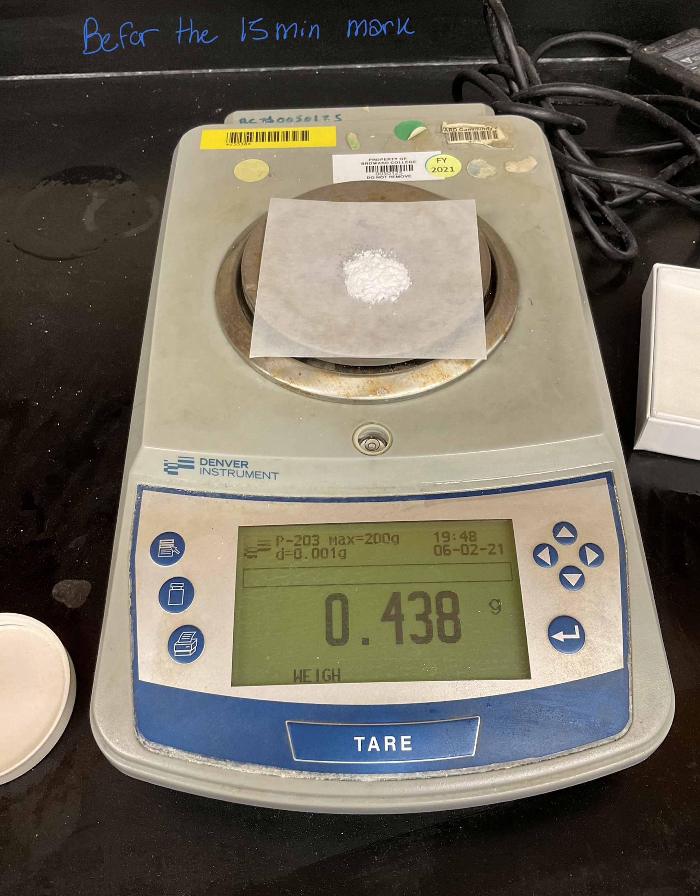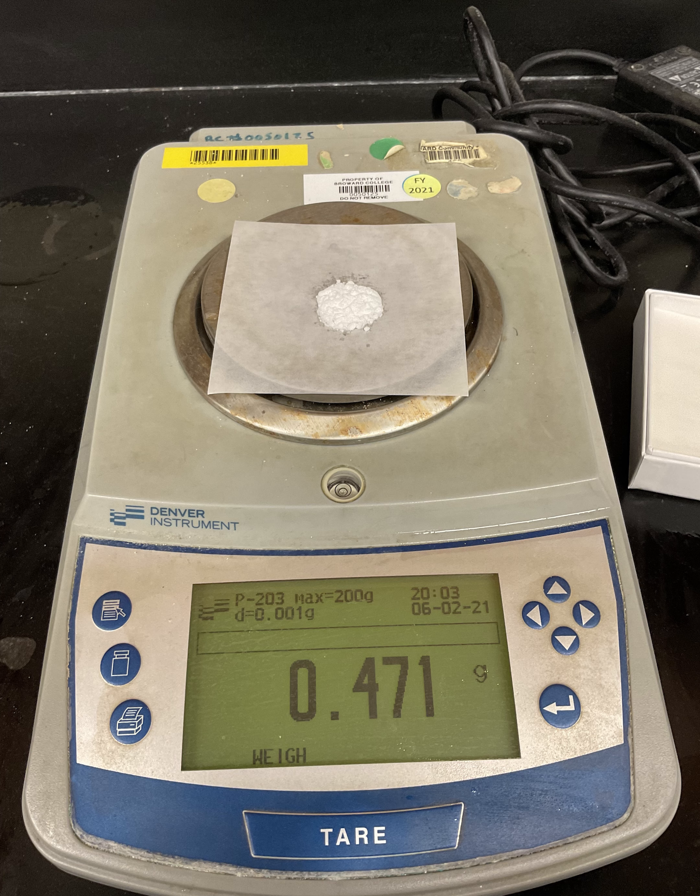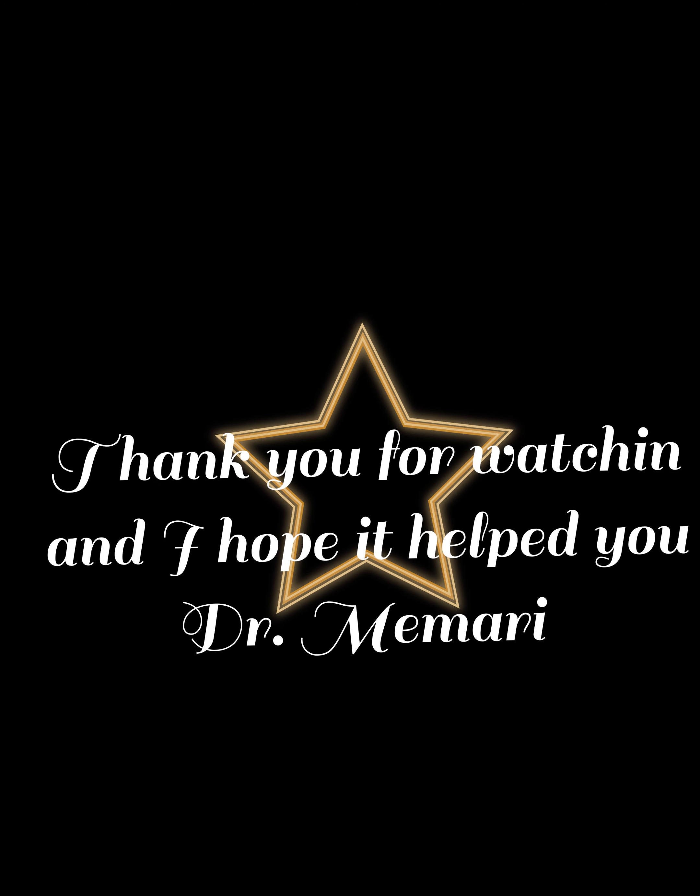Next, we are measuring one spoon of anhydrous calcium chloride. Anhydrous calcium chloride will absorb water and gain weight over time. So we measure the mass of the calcium chloride, wait 15 minutes, then measure the mass again to see how much water was absorbed from the moisture in the air.